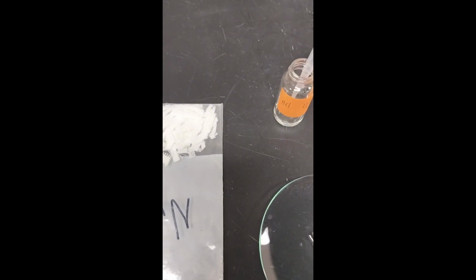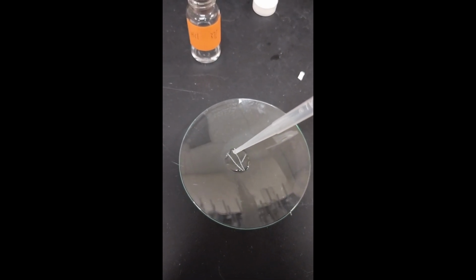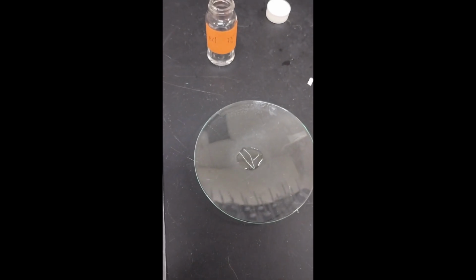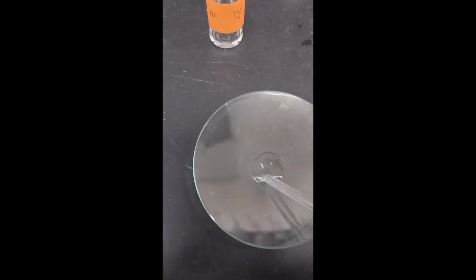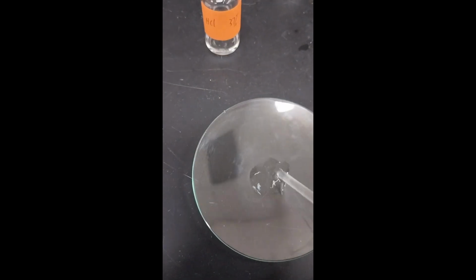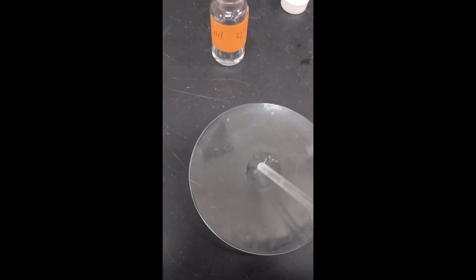Since this fiber did not dissolve in acetone, we will now test it with hydrochloric acid. If the fiber dissolved in hydrochloric acid, we can conclude that the sample is nylon fiber. Within a few seconds, you can see the fiber dissolves completely in hydrochloric acid. This confirms that the sample is nylon fiber.